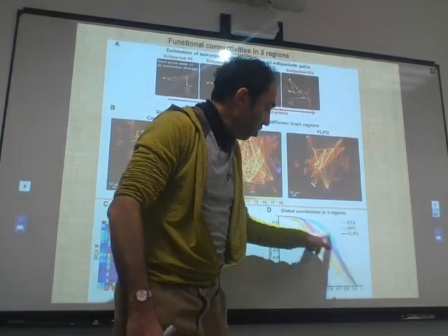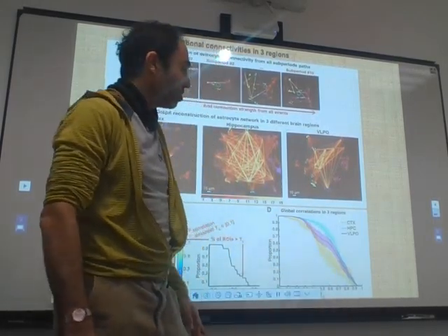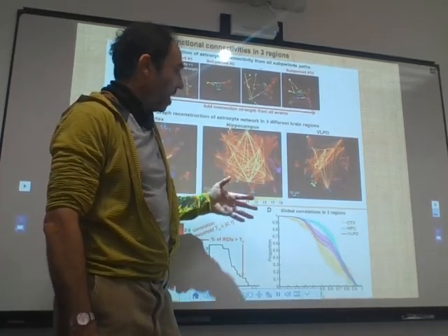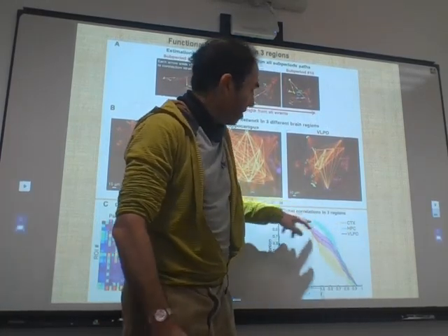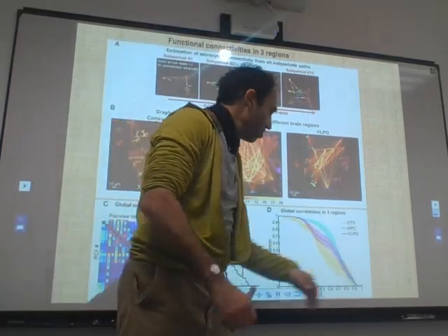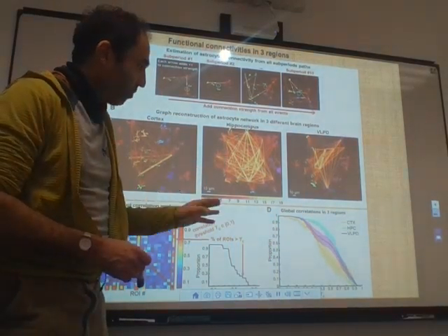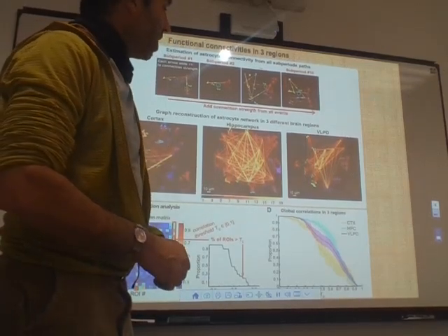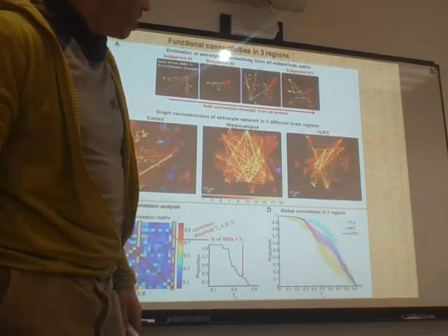This shows that the level of connectivity is different in the 3 regions, with the most stable one being the hippocampus, which stays connected as much as it can when you increase this threshold. So this was the graph that we proposed as a way to measure this level of connectivity across these threshold experiments.